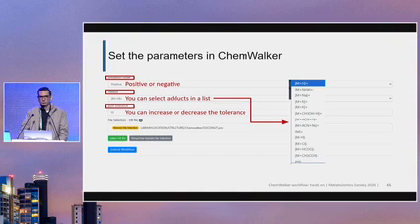Look at the annotations and the chemical information you can get from your data, and then when you're looking for the biological interpretation, be more strict and look for things that make more sense for the pathway or the type of study you're performing.